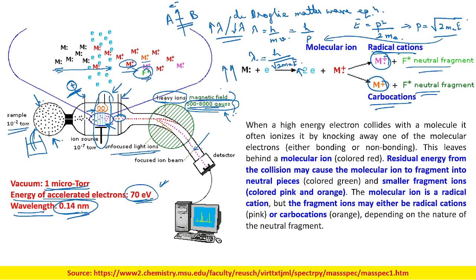However, in actuality it is not the case. We apply a magnetic field across this beam through permanent magnets, and this magnetic field results in the formation of a spiral path. It is moving in a particular direction, but it is spiraling.